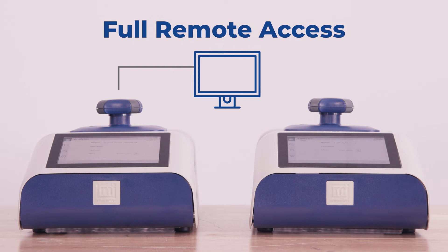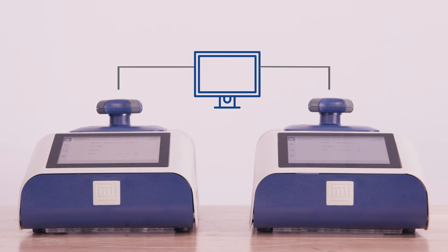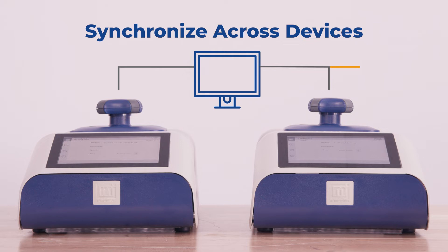Start analyses, review data, and set up methods all from your desk. You can connect multiple instruments to the network and synchronize results and methods across devices, including the previous models of the AccuPIC.